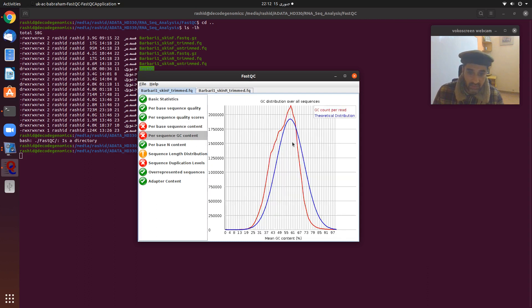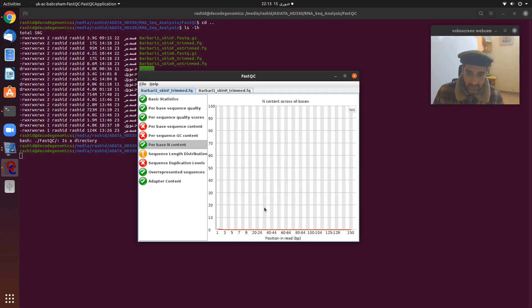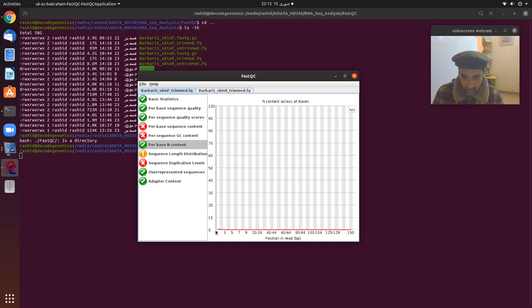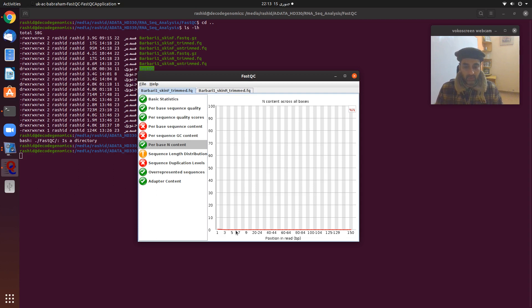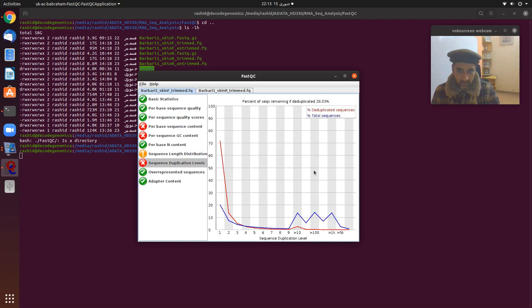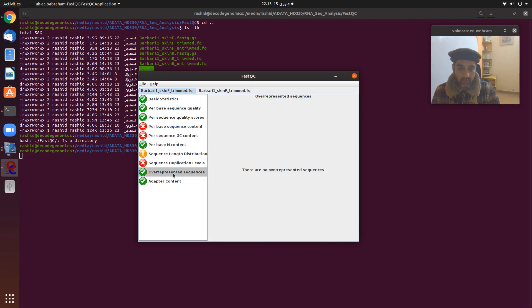The per sequence GC content shows that the mean GC content is around 57 percent. Next is per base N content: the red line shows the N content is almost zero, which is what we expect — there should be no N bases in our sequences. The sequence length distribution shows sequences from 150 to 151 bp. Finally, the sequence duplication level is also displayed.